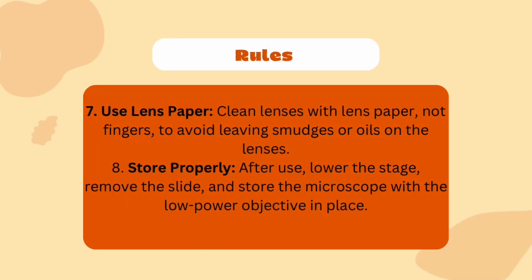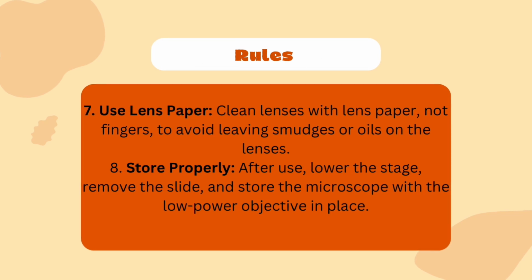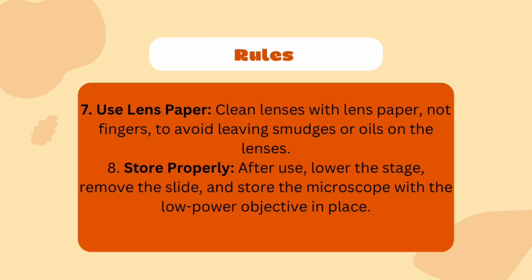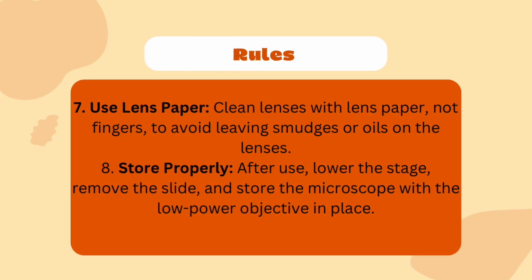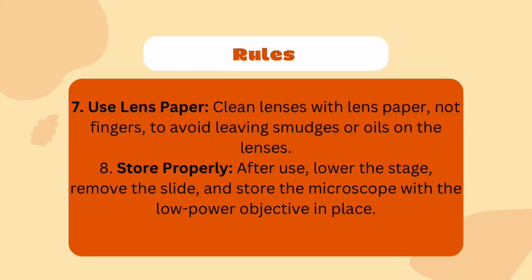Next, use lens paper. Clean lenses with lens paper, not fingers, to avoid leaving smudges or oils on the lenses. Next is store properly. After use, lower the stage, remove the slide and store the microscope with the low power objective in place.